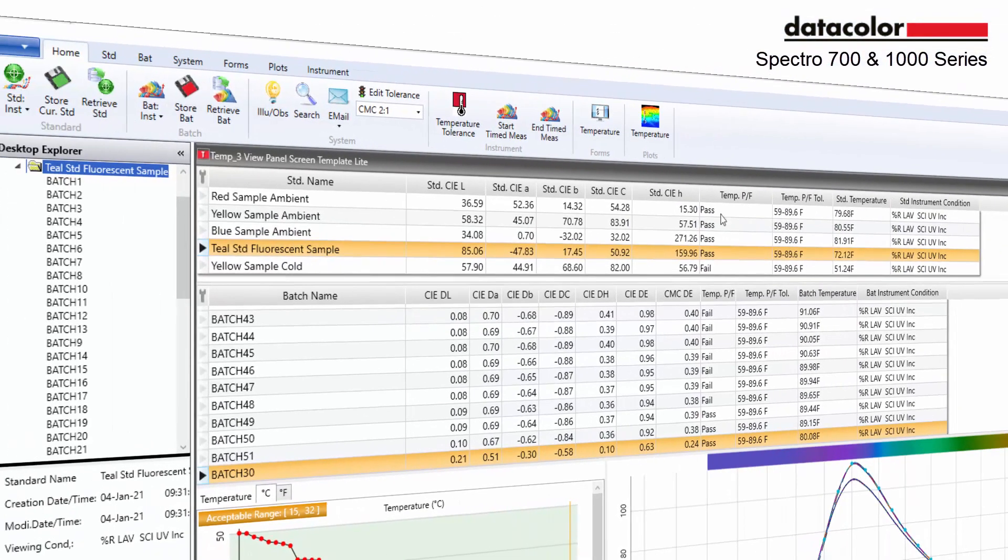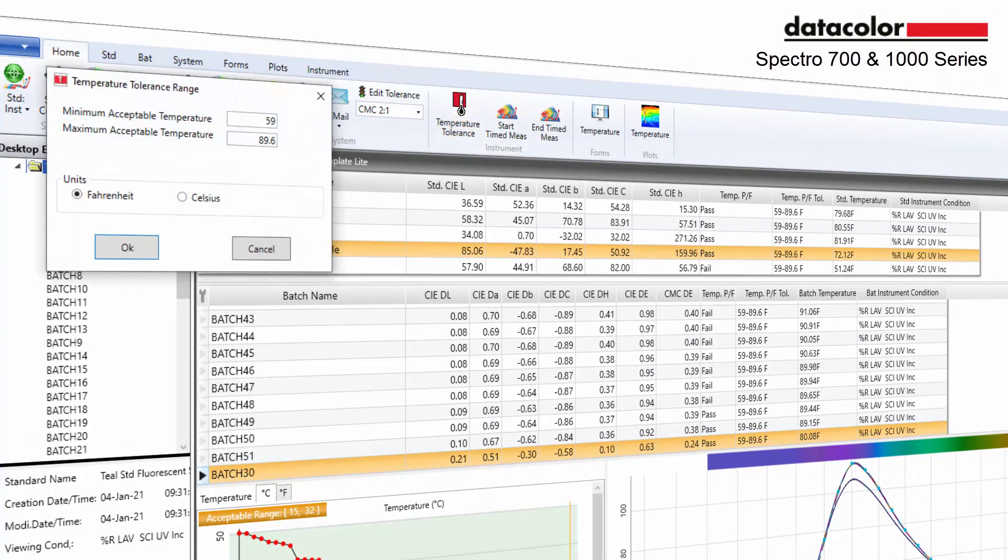Users can also add the temperature tolerance icon to the home bar. This icon allows the user to control the temperature range at the system level.